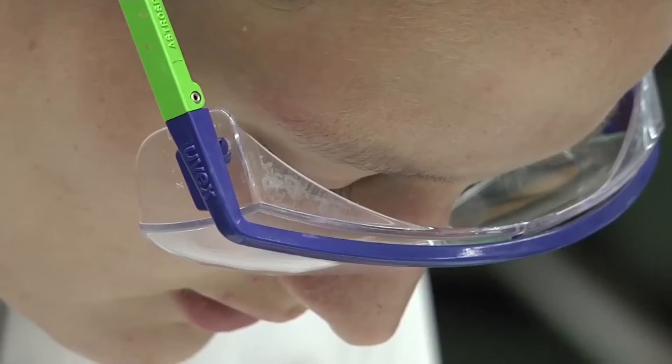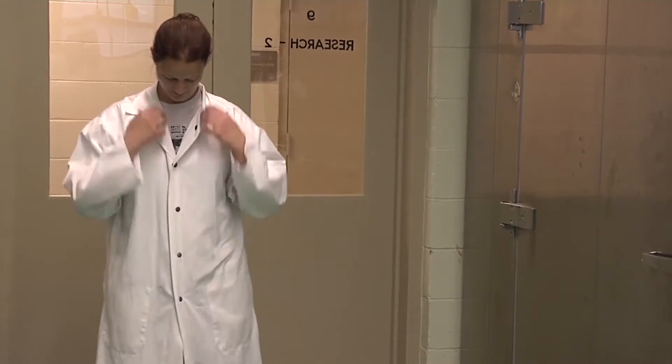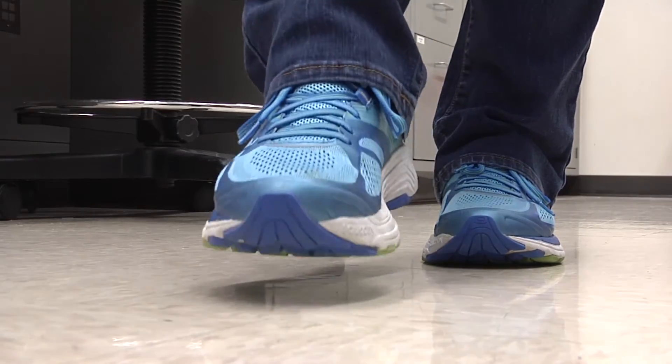Employees measuring pH should always wear eye protection, a lab coat or apron, as well as non-latex gloves and closed-toed shoes.